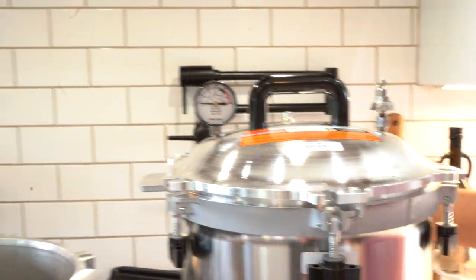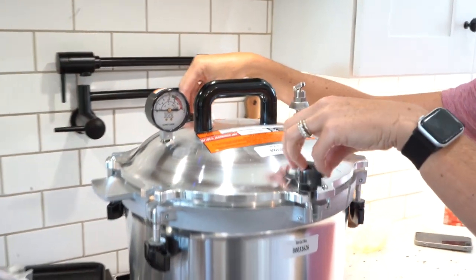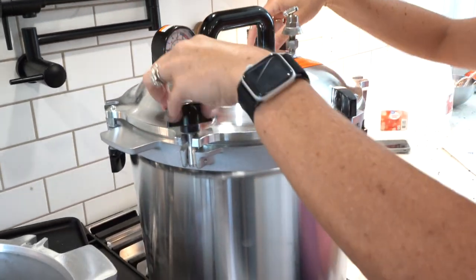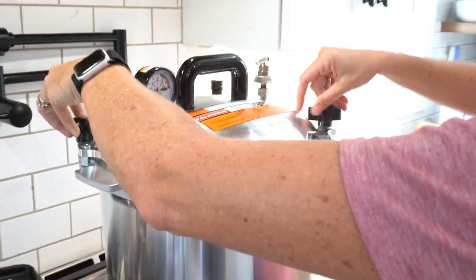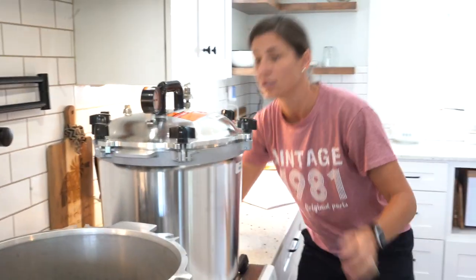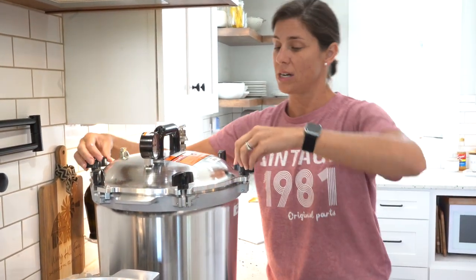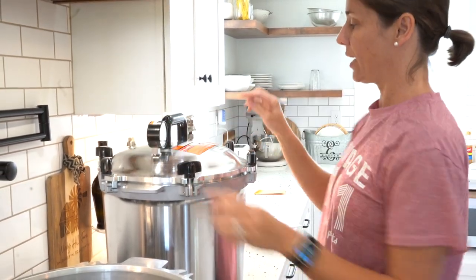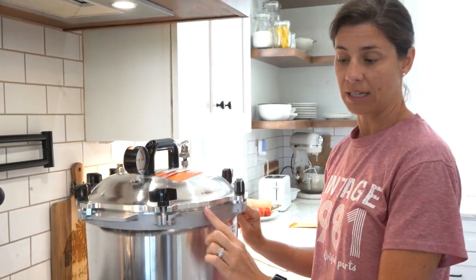Just like with the pressure canner, you want to tighten two at a time — the ones across from each other. I'm just barely tightening them right now to make sure everything looks even, then I'll go back and tighten them more. Tighten the opposite wing nuts at the same time to make sure it's all staying even. If you try to tighten one at a time you're going to end up with your lid all cattywampus and not have a fairly even space.